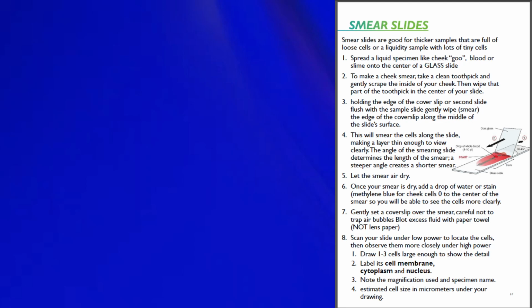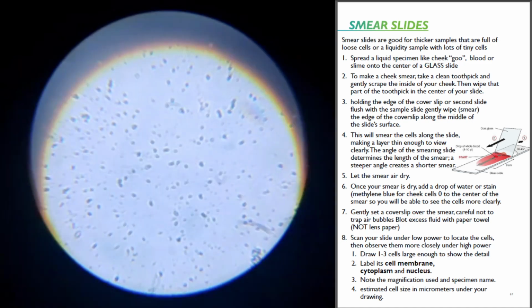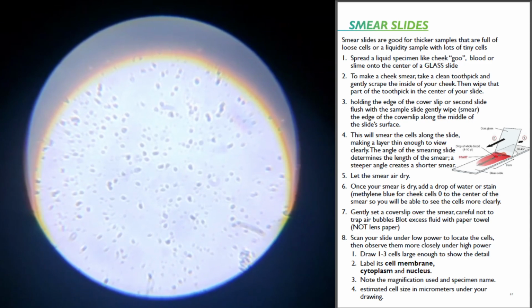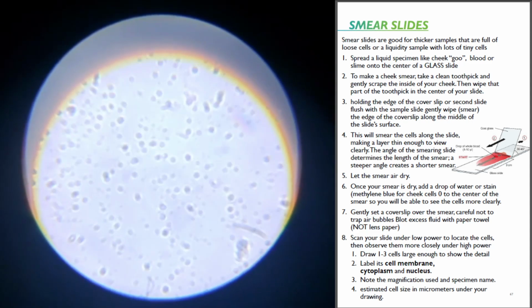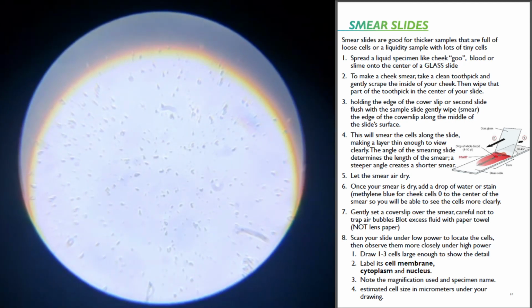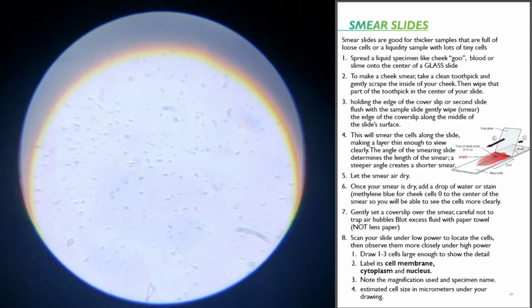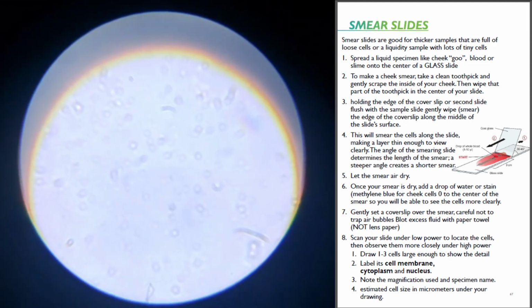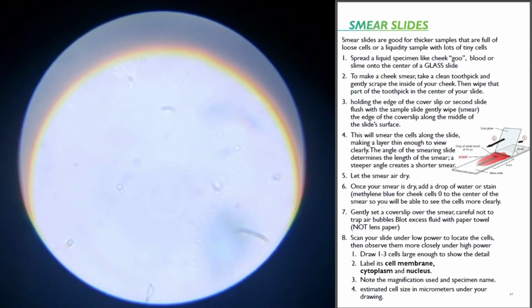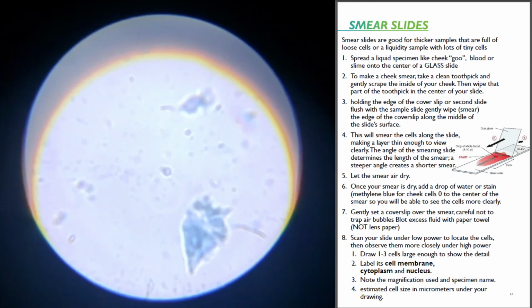I'm flipping it over for the next magnification. Nothing moving. So right now I'm at the 40x objective, 10x ocular. I'll look around, see if I can find that cluster again. There's some blue, see what I can find. There we go, there are some cells.